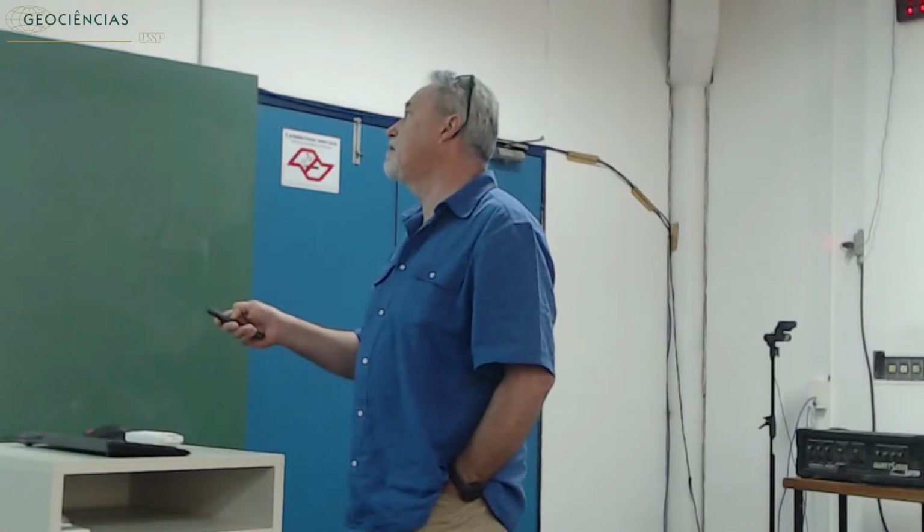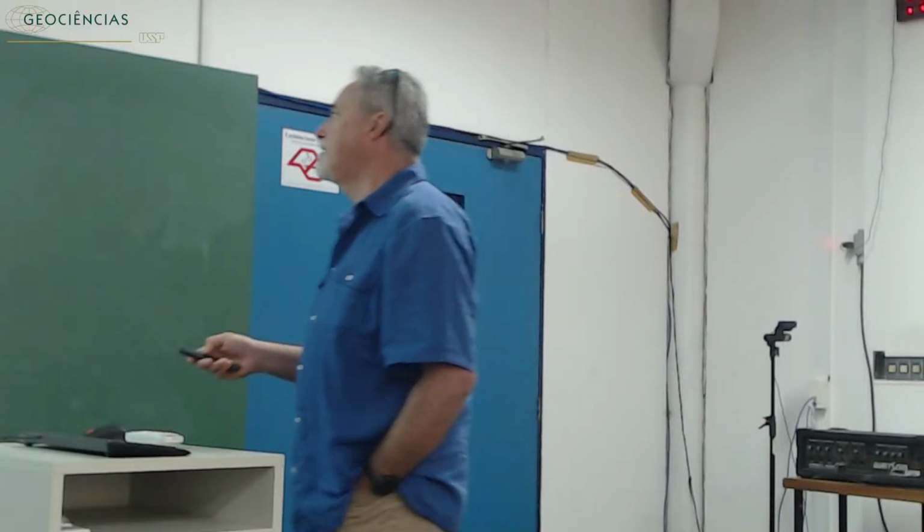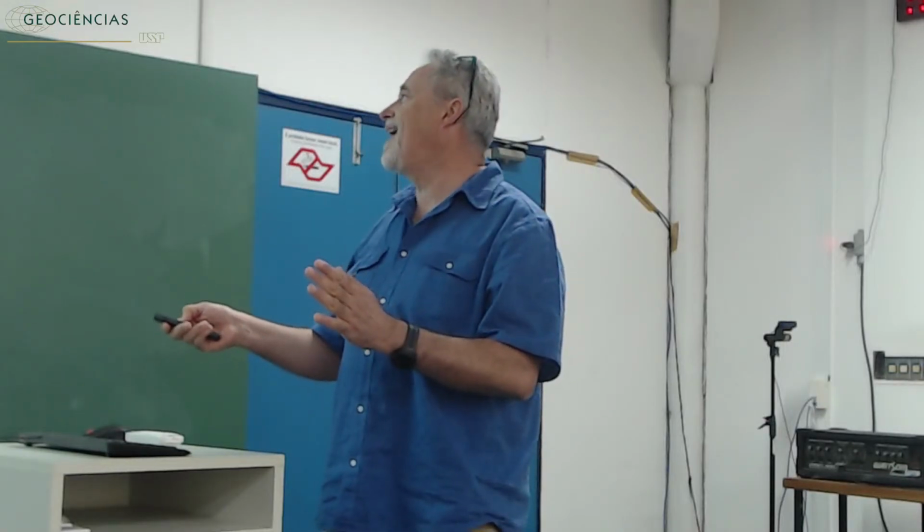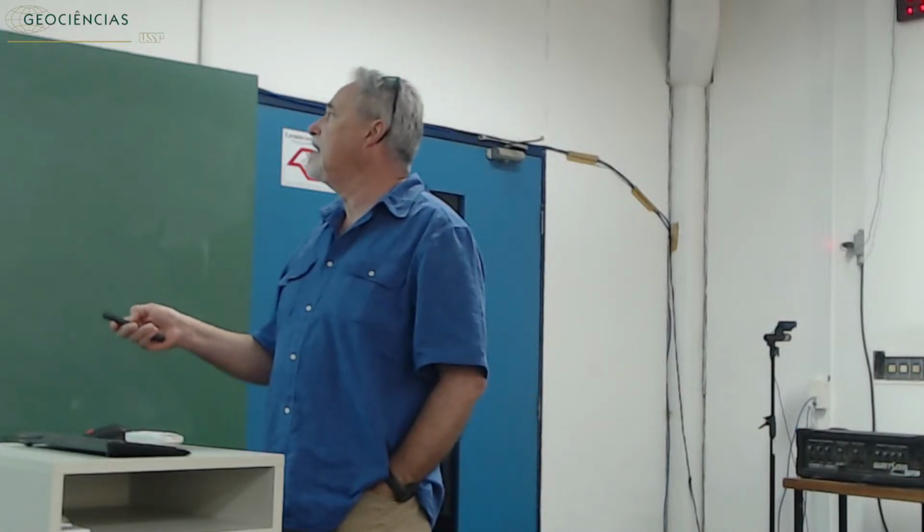These are the spectra of the pristine and charged materials. And we see that all the pre-edge peaks of vanadium are close to the trivalent member. They do not go much closer to where they should be if it were octahedrally coordinated vanadium 4+. So there is some scatter because the synthesis conditions were enough to obtain iron perfectly divalent, but there was some oscillation and there was some minor amount of vanadium 4+. But basically, what we get is that in the doped material, vanadium does not participate in oxidation.